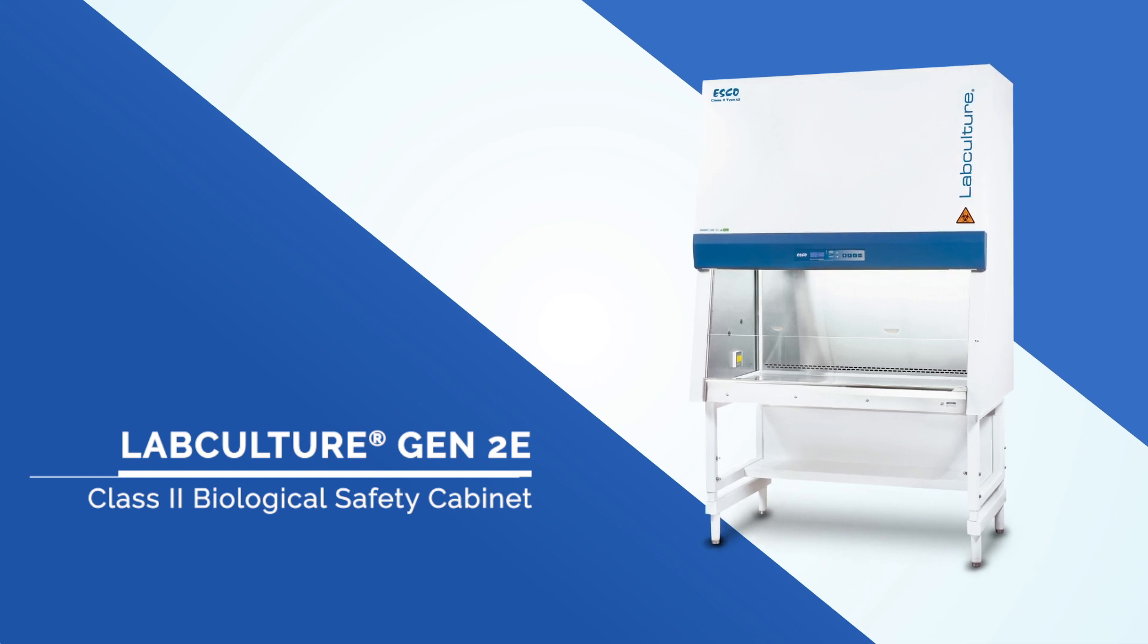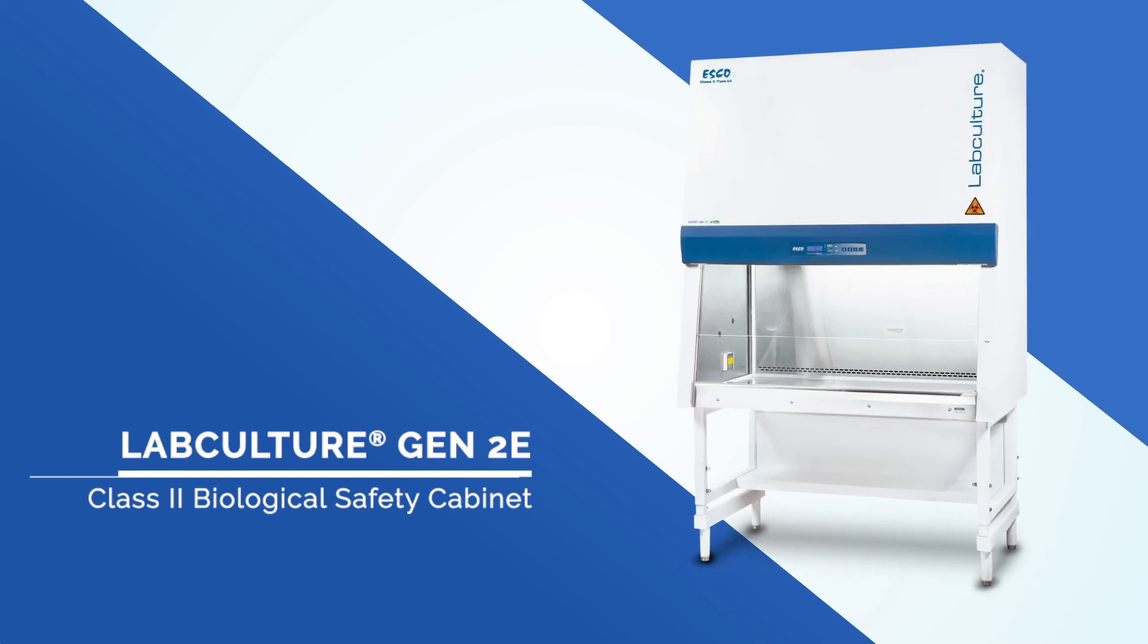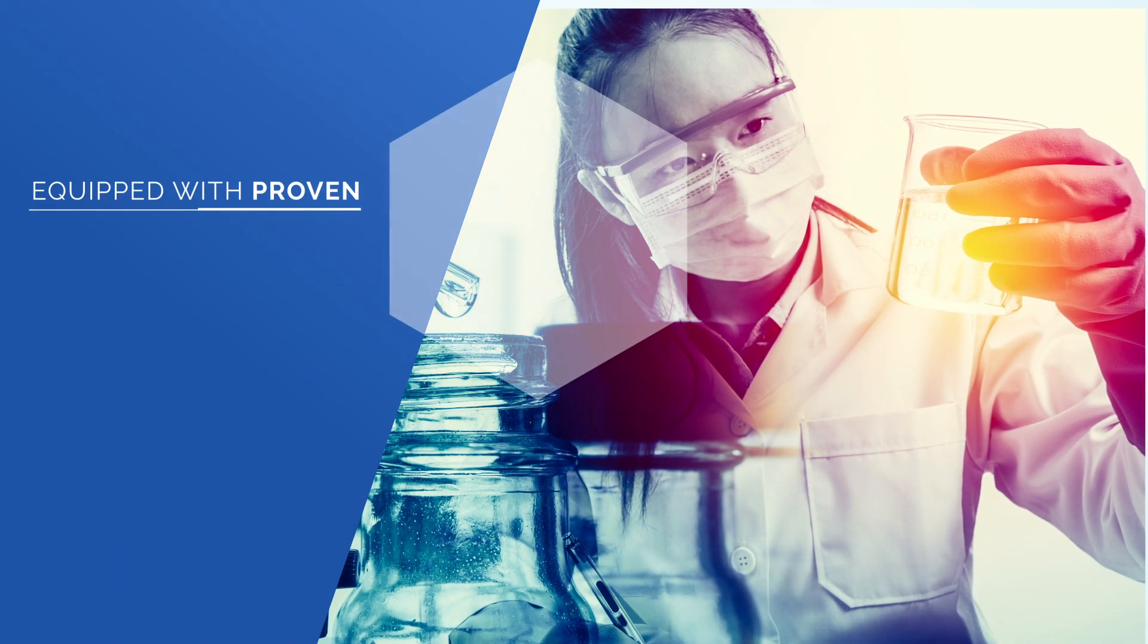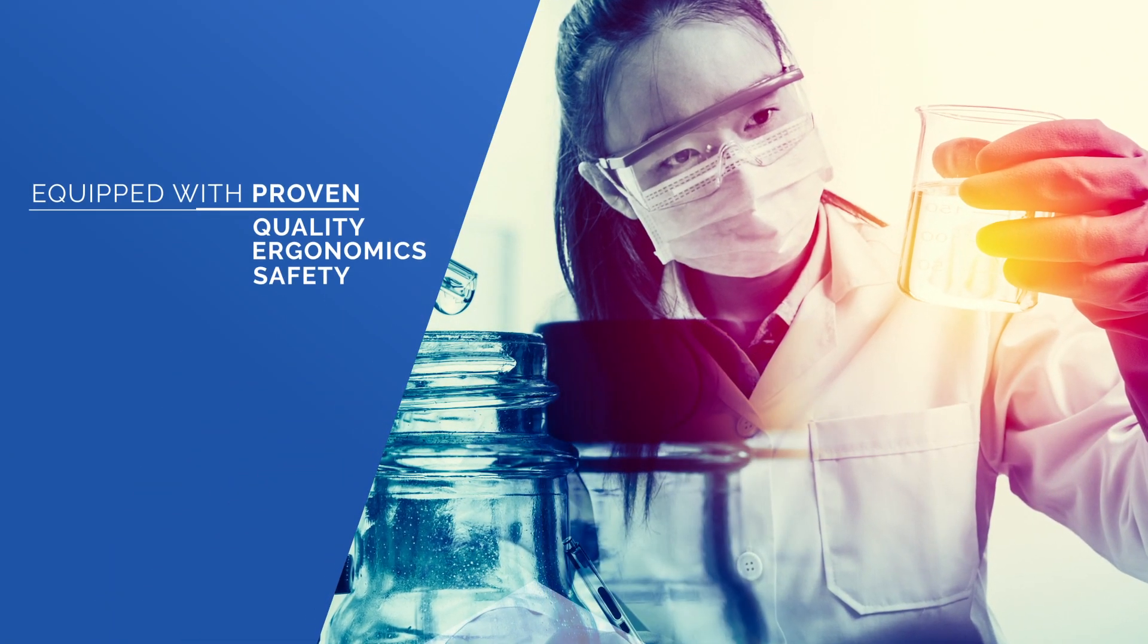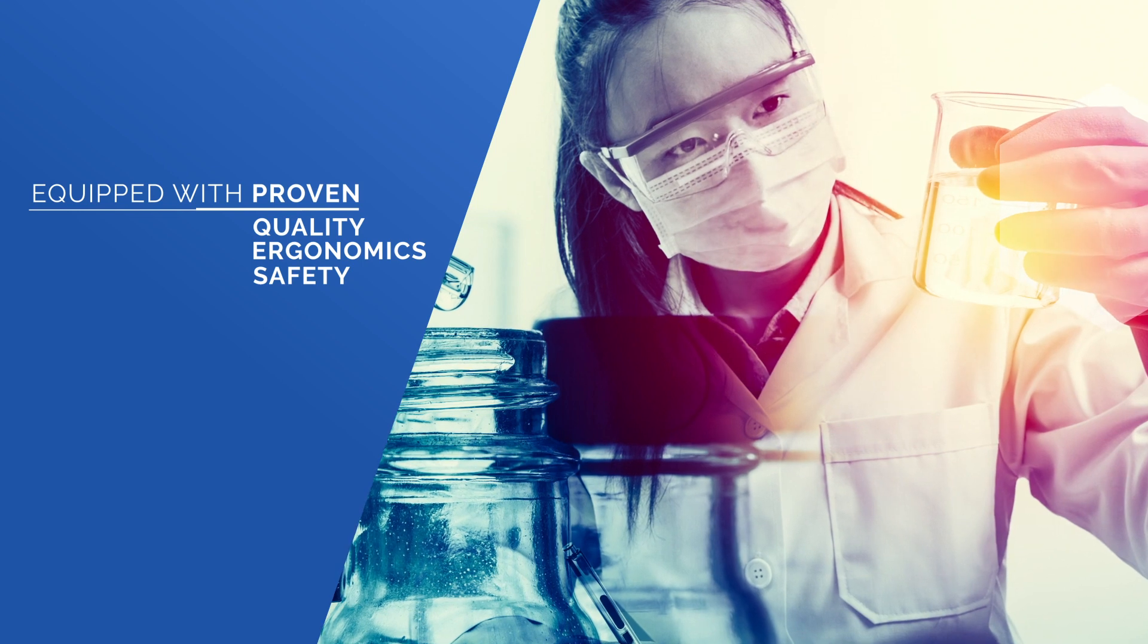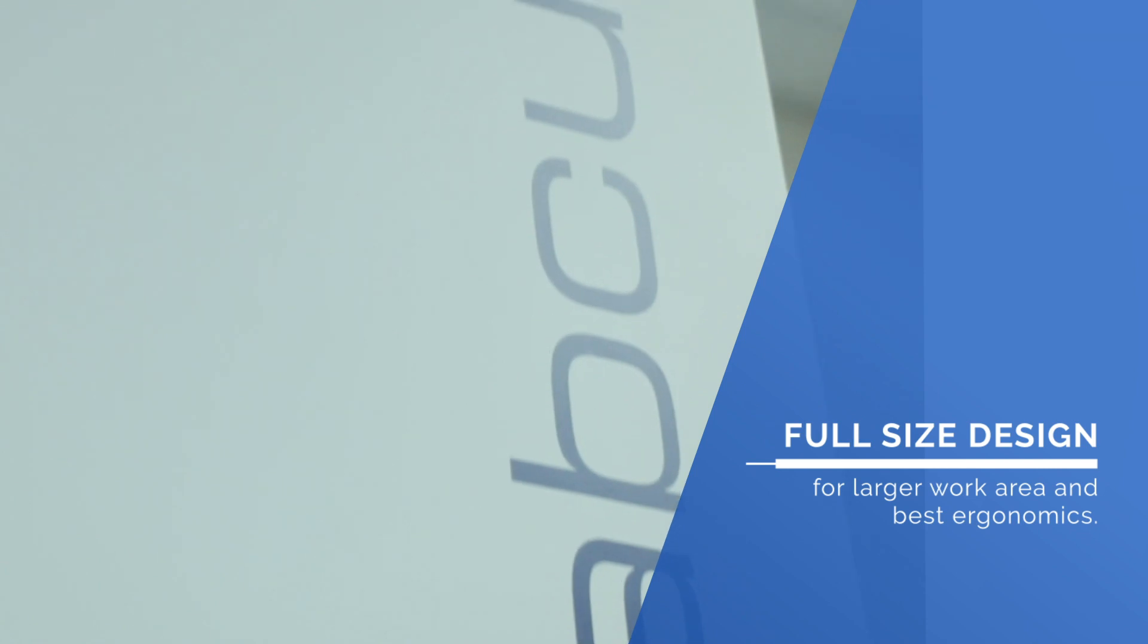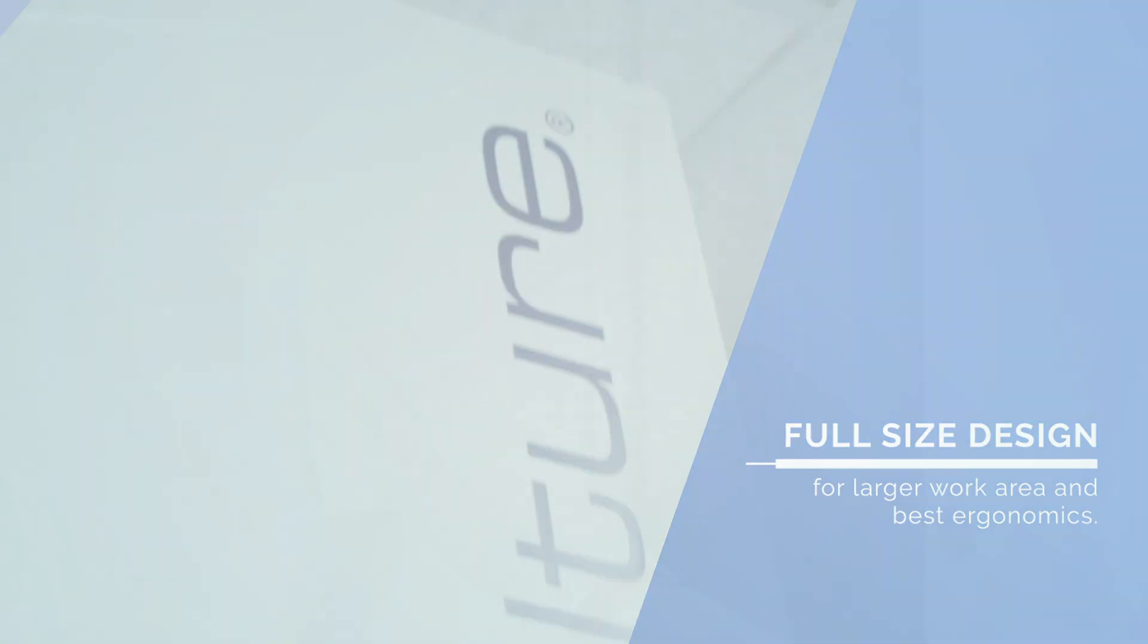LabCulture Gen2E Class II Type A2 Biological Safety Cabinet is equipped with features of proven quality, ergonomics, and trusted to provide user, product, and environment protection. With its full-size design, it has larger work area and best ergonomics.